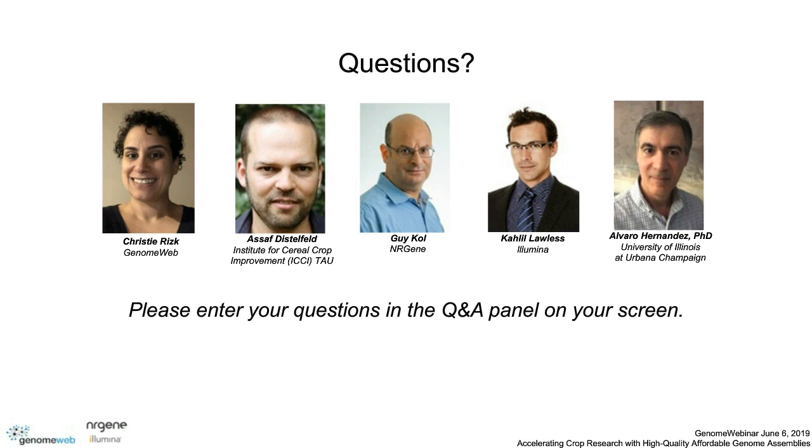We'd like to know if anybody could comment in detail about how the described short read techniques, or even 10x or mate pairs on the NovaSeq 6000, how you think that competes against long read technologies such as PacBio or Nanopore for de novo assembly generation in agri-food. Who'd like to take that one first? So I'll take that one.